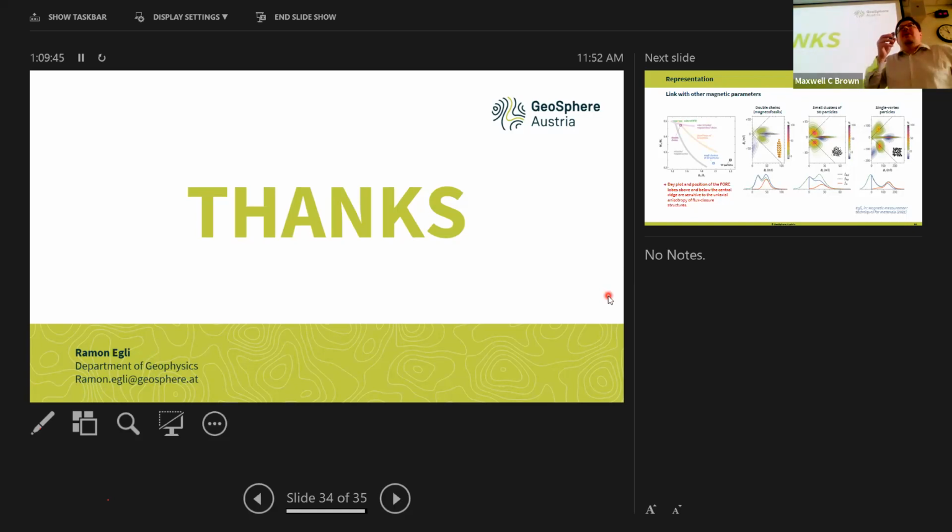And that's impossible for a non-expert to interpret. But I think on the other hand, it's now probably easier to process and devise FORC measurements for marine sediments in recent years than before, because of a lot of literature that has been produced on this argument. So I think it's always a balance. And concerning the automatization of the processing, as I say, in principle, it is possible to have a universal working algorithm.